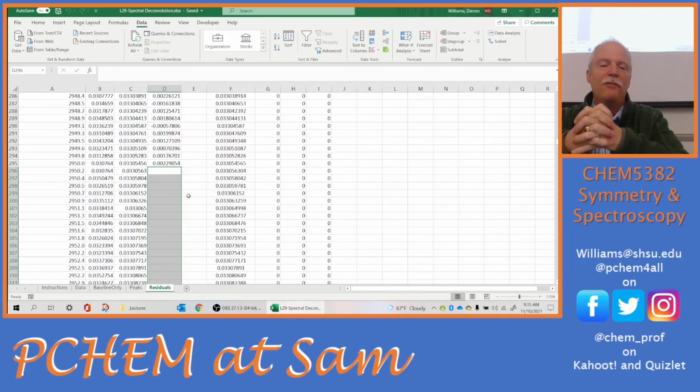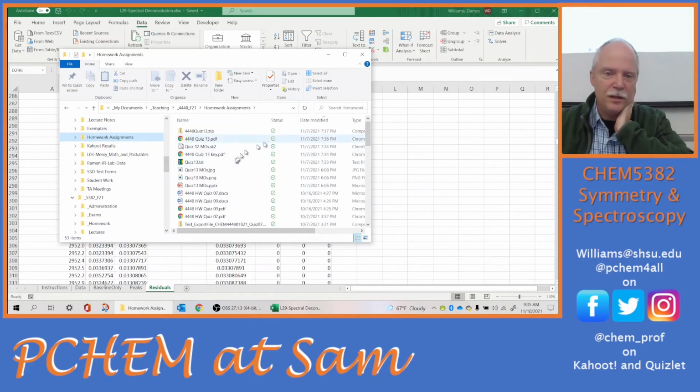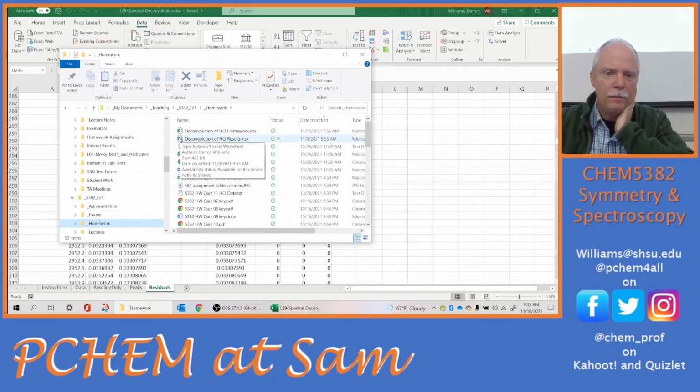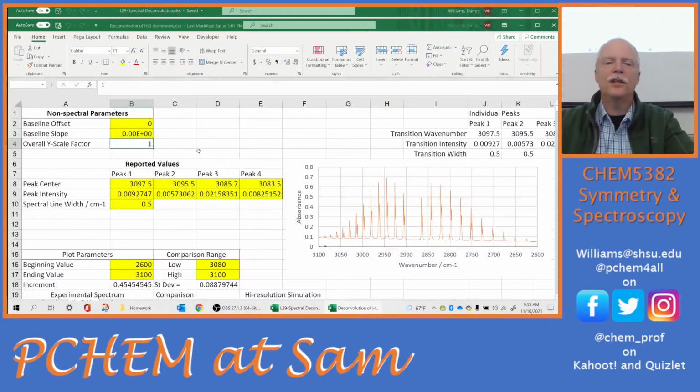In fact, I've put in your spreadsheet, I'll show you what I'm talking about. This is the homework assignment spreadsheet that you guys are going to use. Come on, where is it? Oh, different class. Sorry. Yeah, the homework. Okay, so this is your assignment page.